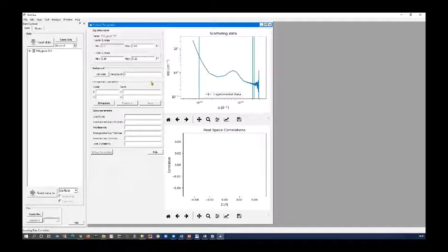So the first thing I'm going to do is set some range limits to define the extrapolation. I'm going to do the low one first, with some values that I've already played around with. It seemed to give a reasonable result. Go.